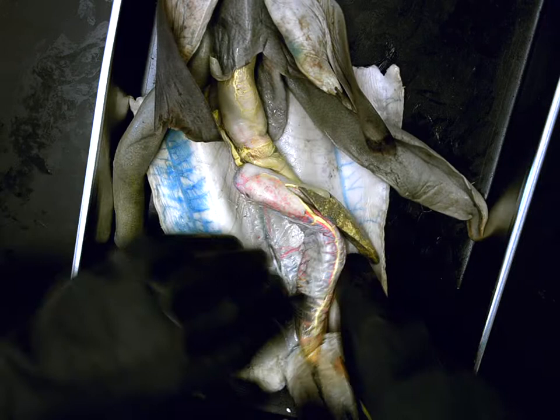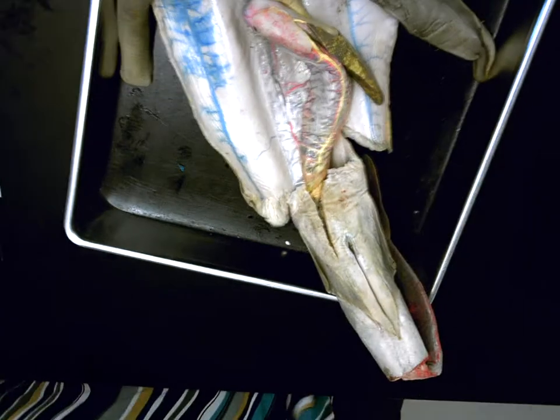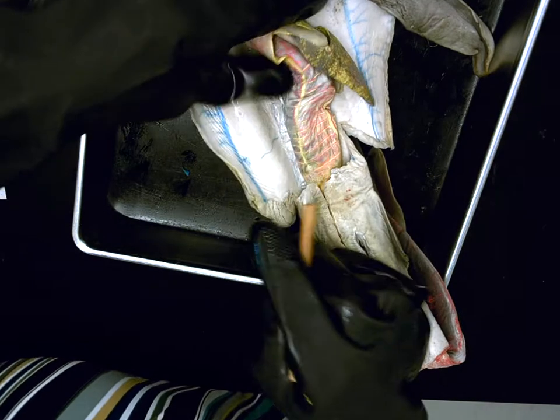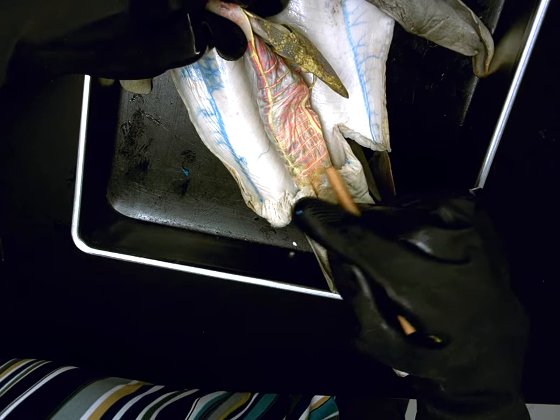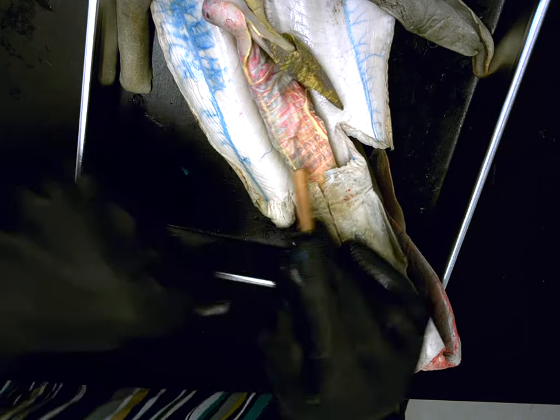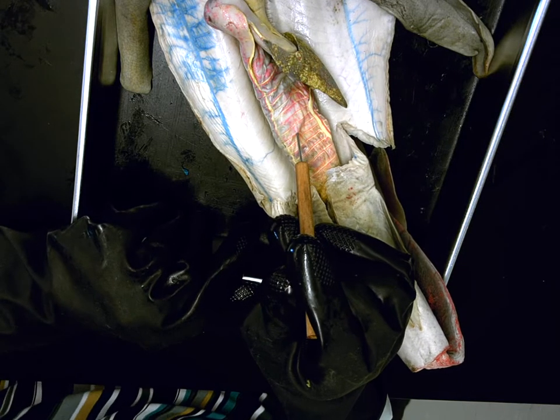Excellent. Going down further. Let me angle this out even more. Again, if we then go from our pancreas, we now have this beautiful banded structure. All these bands of pink and yellow are blood vessels that have been injected. You'll learn the name of all of those next. But the name of this entire structure that is pinned would be what, Justice? The intestine. Excellent.